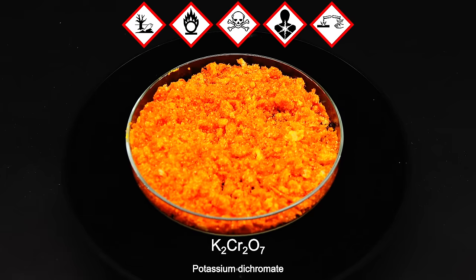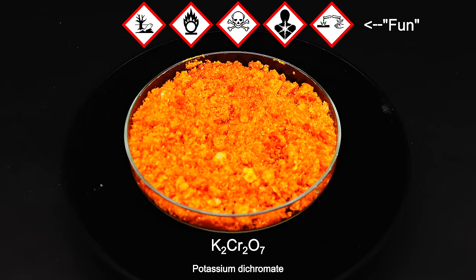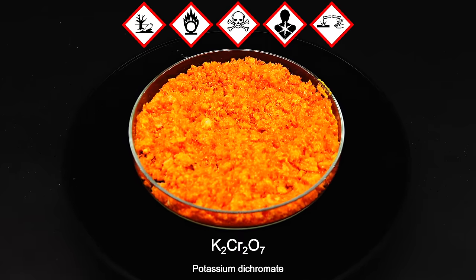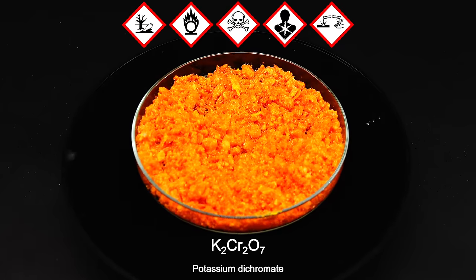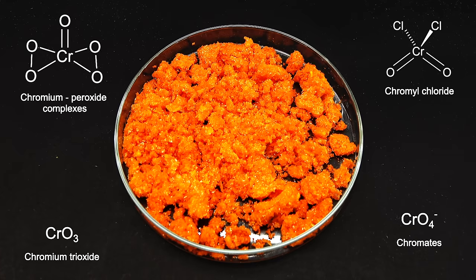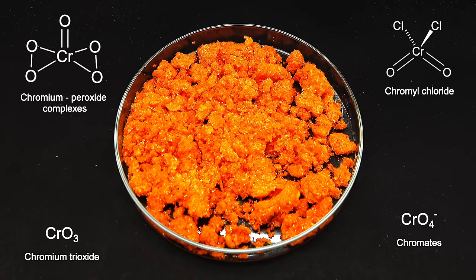Just hearing all these colorful descriptions of this thing makes it seem really fun, and for me, completely justifies making it. However, I actually do this whole project not just to test my lab survival skills, because potassium dichromate turns out to have a lot of uses apart from giving people cancer. It's a versatile oxidant, and I like to think of it as a gateway to a wide spectrum of other interesting and somehow even more dangerous chromium compounds, the properties of which I will definitely explore in future videos.